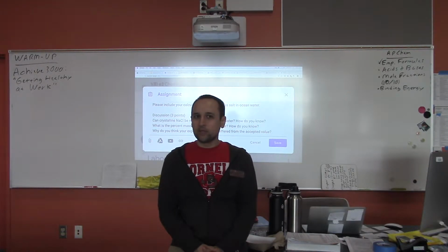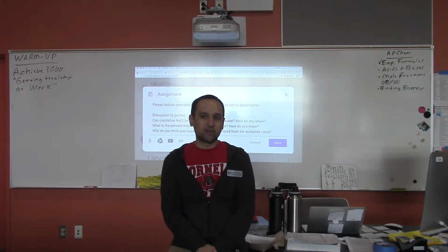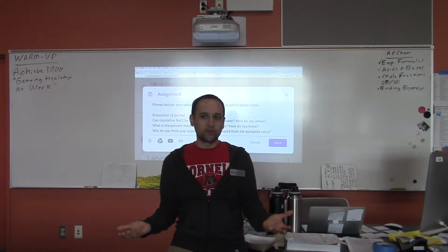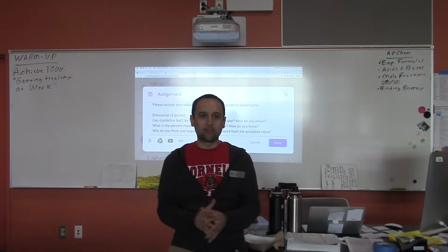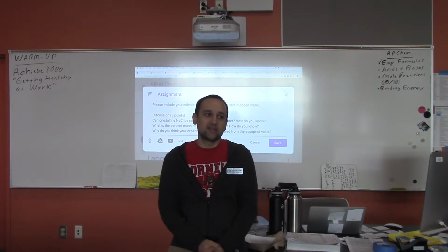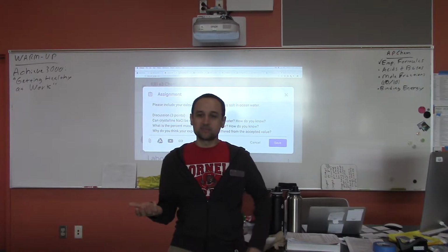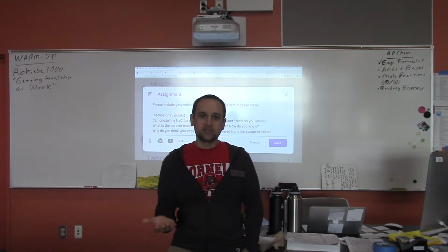So does anybody remember what you can do if you want to wind up with really nice salt crystals? I may have talked about it. So if boiling is really disruptive, what could you do with ocean water if you just want it to slowly evaporate to give really nice salt crystals? That ends up being what now? Leave it out. Yeah, you could literally just leave some salt water out in sort of like a shallow dish, and after maybe a day or two, it would evaporate and it would just leave nice crystalline sodium chloride, right?